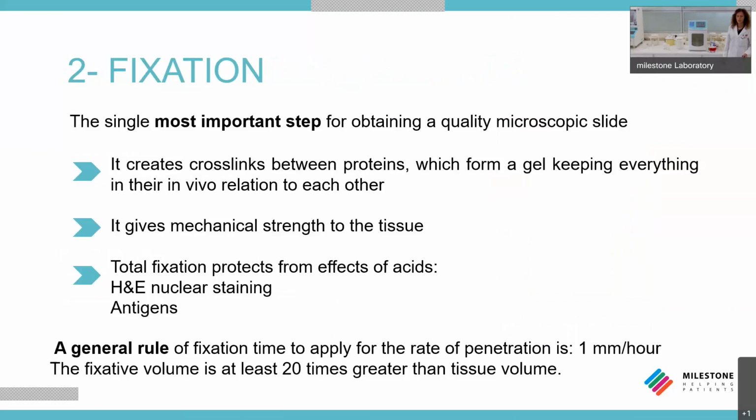And now let's move to fixation, which is one of the most common applications in pathology labs. As you know, the main goal of tissue fixation is to preserve cells and tissue components in a lifelike state, and to do this in such a way as to allow for the preparation of thin stained sections. For practical purposes, the fixation aims to prevent or arrest the degenerative processes which begin as soon as the tissue is deprived of its blood supply.